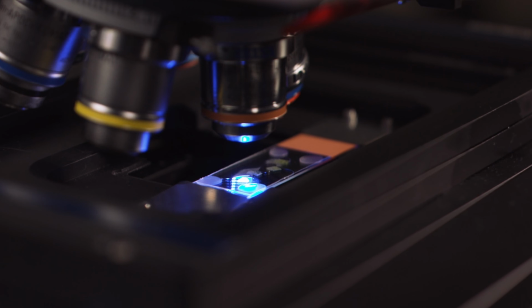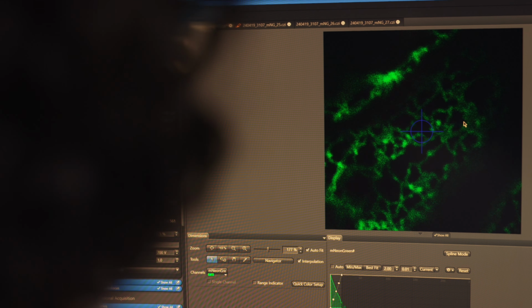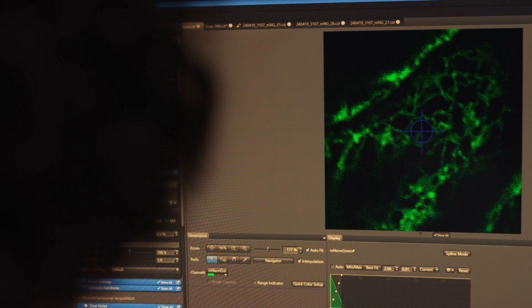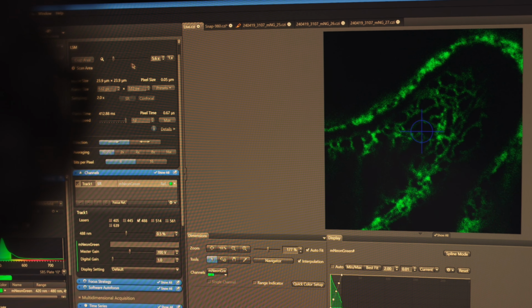The strategy was to enlarge the size of the cell where the proteins are produced and folded. Let's say like this, if we have a larger factory, we expect to be able to produce more product. What we can see here very nicely is this network of tubules that constitute the endoplasmic reticulum. You can see very nicely the dynamic of this organelle. It's continuously being remodeled. We can see these tubules forming this network.